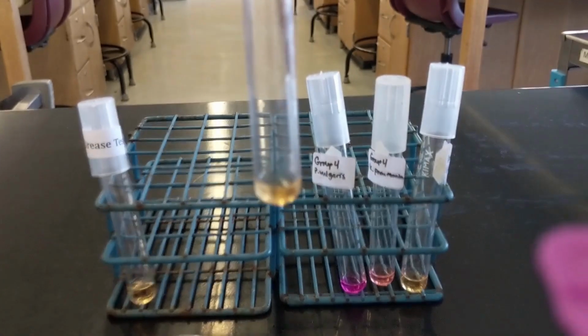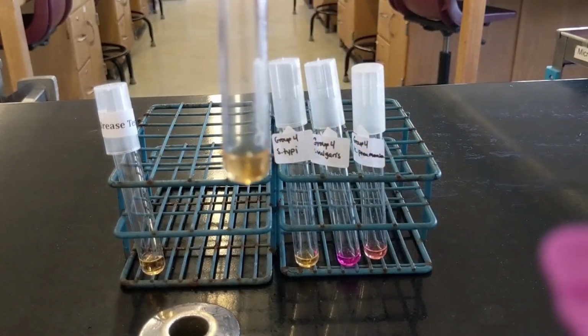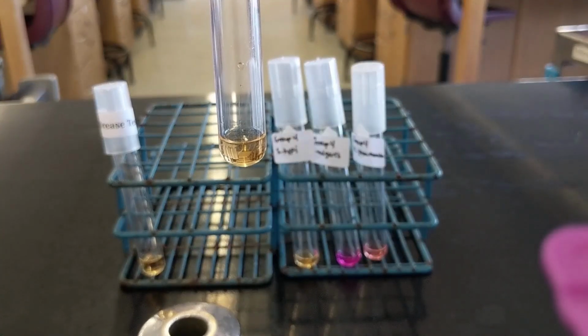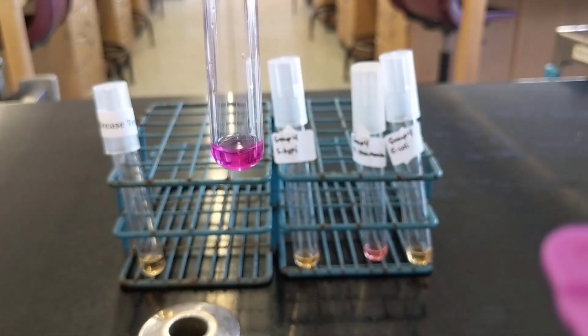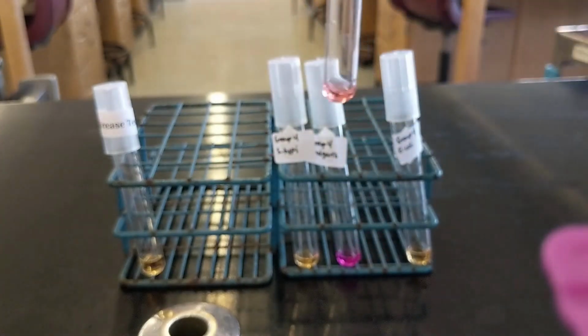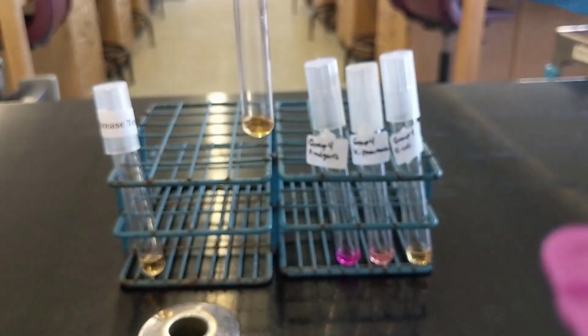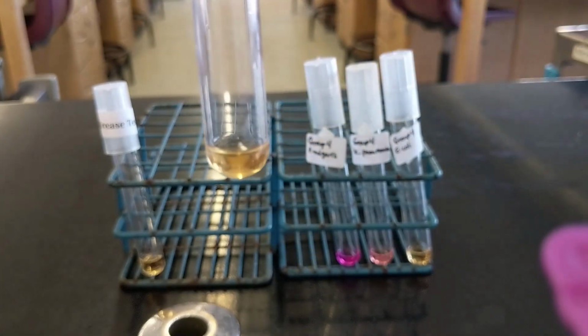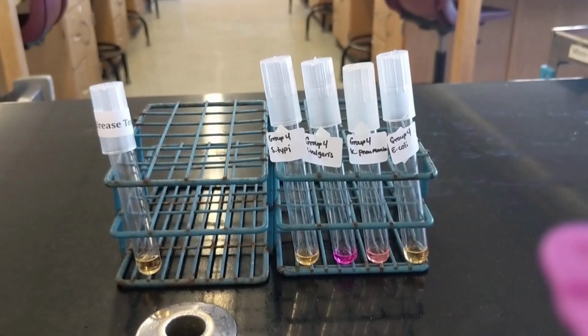still this yellow color, and then E. coli, which we tested, is still this yellow color. That's better. Let's see. P. vulgaris, Klebsiella pneumoniae, which is maybe a slower breakdown of the substrate, and then Salmonella typhi. And then you could refer to pictures as well.